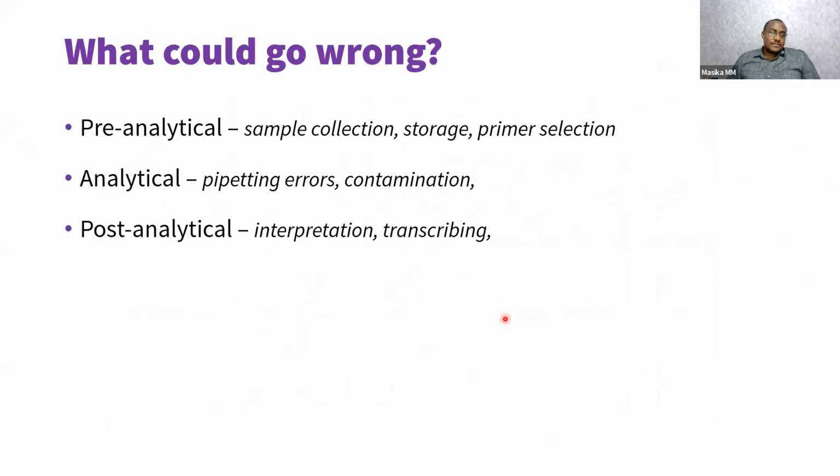What could go wrong? Pre-analytical, meaning before the test. Sample collection, as we explained earlier, can be an issue. The storage, how you store your sample after collecting. For example, I was doing research in Kibra and in Taita. The samples in Taita, we had to collect them the same day and store them at a freezer, which was -20. If you leave it out there, it will not be a good sample.